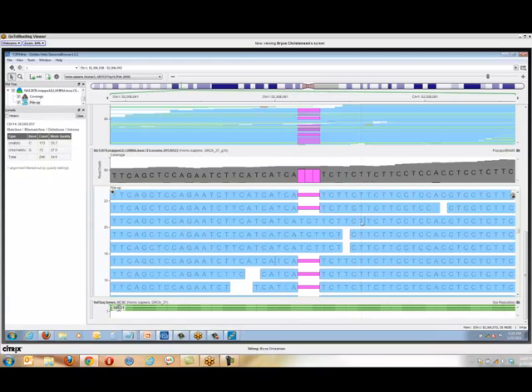Most aligners don't like to call indels unless there's no other choice. And here we have a deletion of a repeat sequence, but since this read wasn't long enough to span past the repeat, the aligner chose to just call it as not a deletion. So this is something to watch out for when you get into indels.